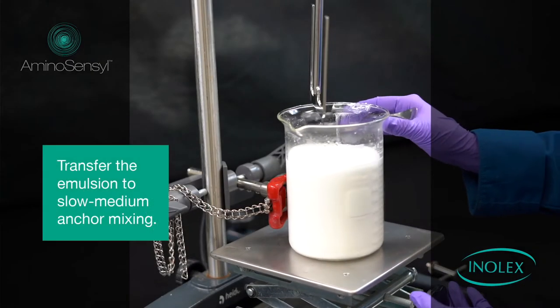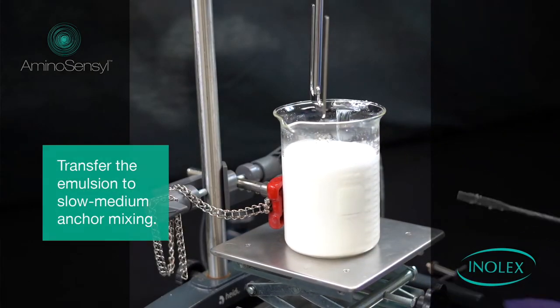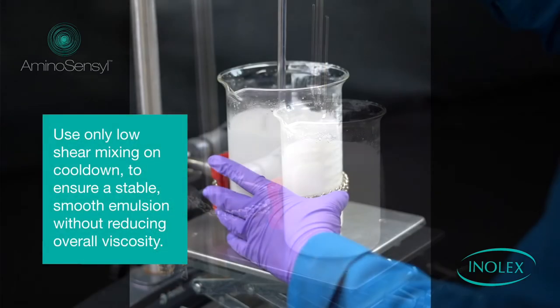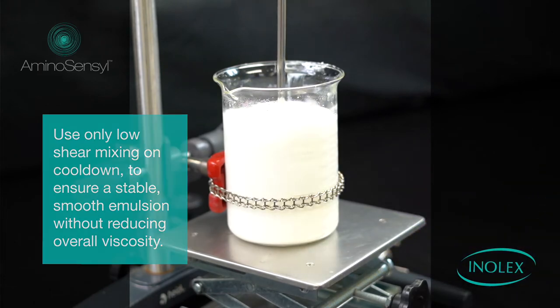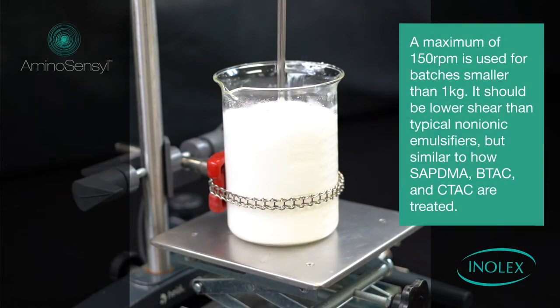Transfer the emulsion to slow, medium anchor mixing. Use only low-shear mixing on cool-down to ensure a stable, smooth emulsion without reducing overall viscosity. A maximum of 150 rpm is used for batches smaller than 1 kg. Use lower shear than a typical non-ionic emulsifiers, but similar to how SAPDMA, BTAC, and CTAC are treated.